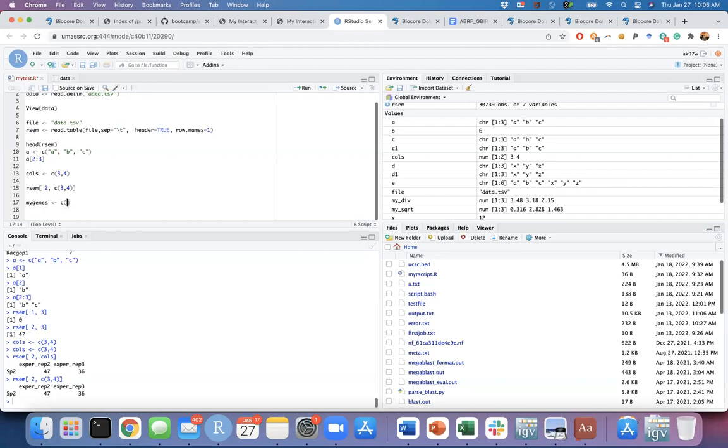And you can put the gene names here now, like I want to do FGF21 and SP2, for example. You can put as many gene names as you want. But again, see, this is how you code. The strings have to be inside of quotes. All strings have to be defined like that. The numbers are not going to be like that. All the strings, as you can see the difference here.